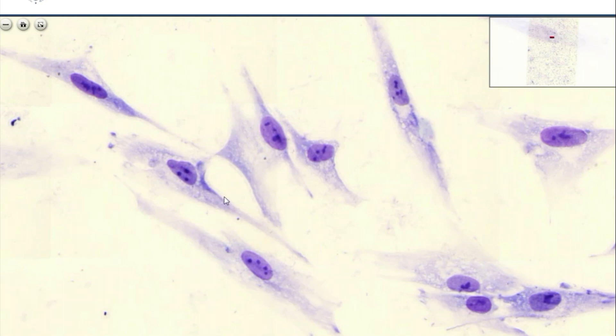So it's possible that you see only a small profile, a roundish profile, or practically nothing of an actual fibroblast.